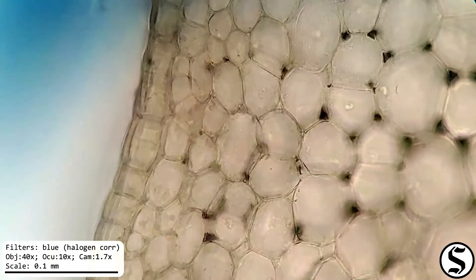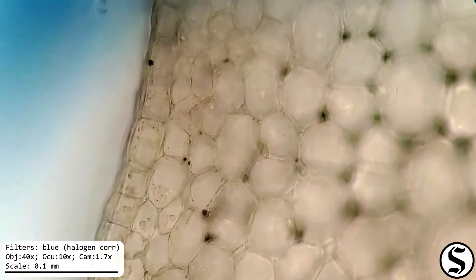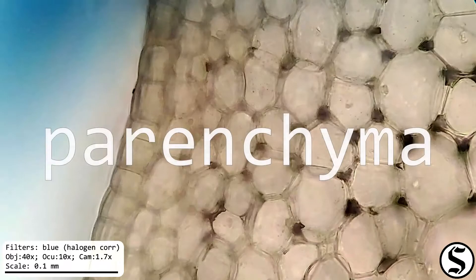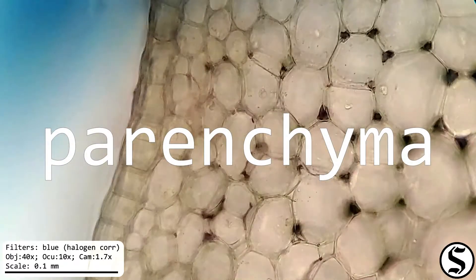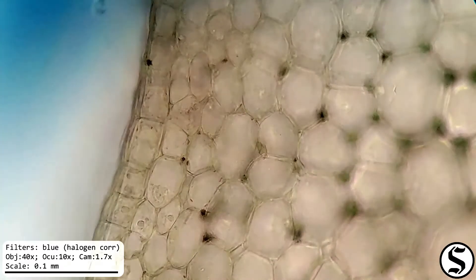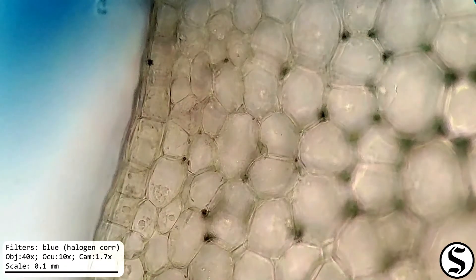And to the right of that the bulk of the celery is composed of the parenchyma that comes from the Greek parenchyma to pour in. And that's sort of the storage zone of the plant.